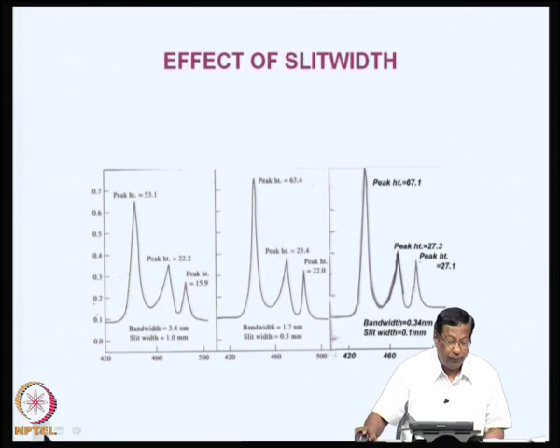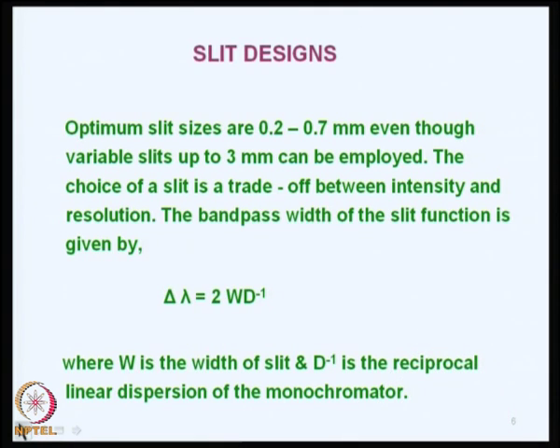So, the job of the slit is to permit a known amount of radiation through a small hole. Basically, it is a mechanical operation, through which the radiation will be passing. Whatever the size of the slit, that will permit radiation to pass through, and all other radiation will be obstructed. It can of course be collected on another concave mirror and redirected onto the slit.